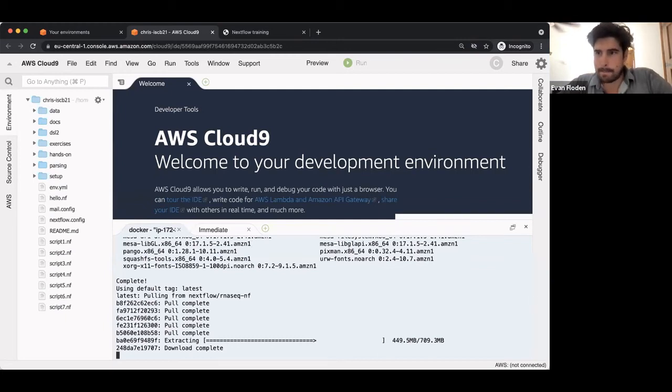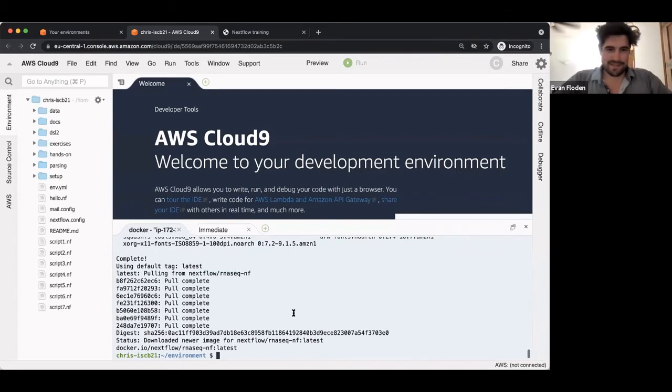Maybe you can try raising your hand if you were successful in installing Nextflow. I'm not sure how you raise your hand. There, okay, I can see some hands raised. Great. Awesome, thank you. That's great to see. Good job, everyone. Awesome. So I'm going to install Nextflow now.